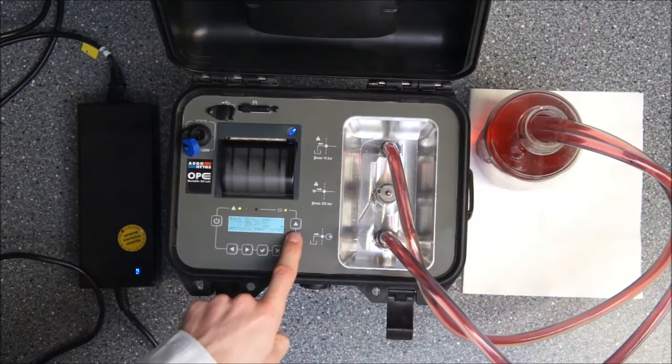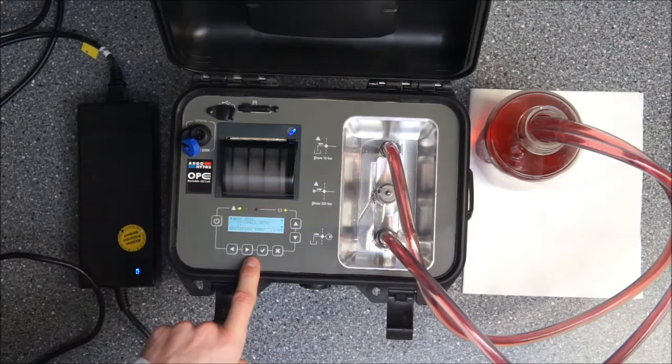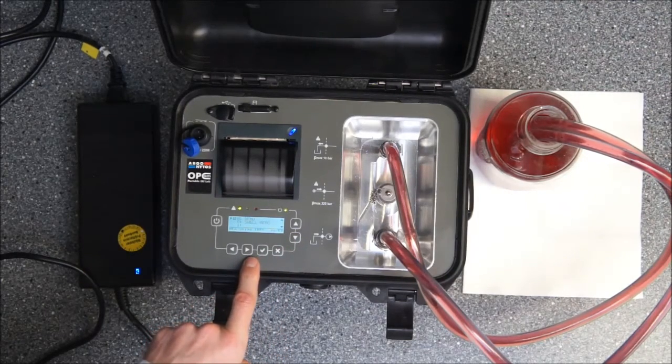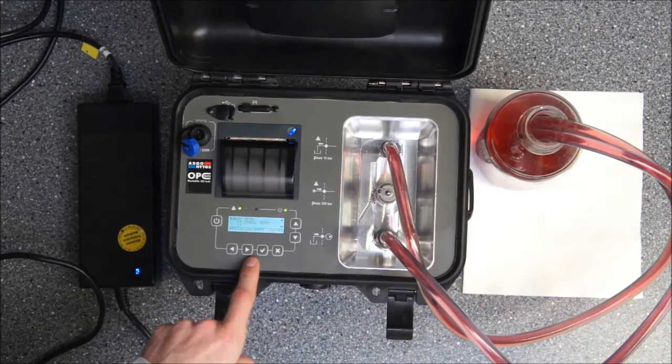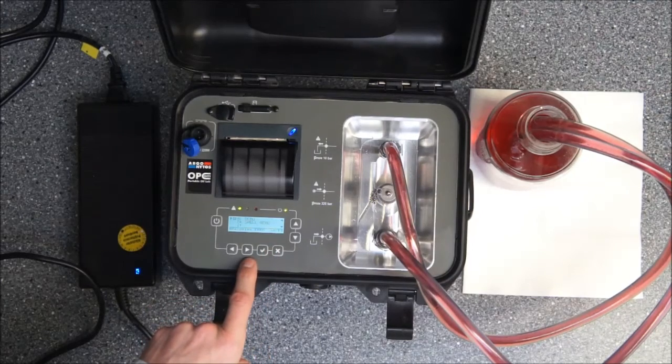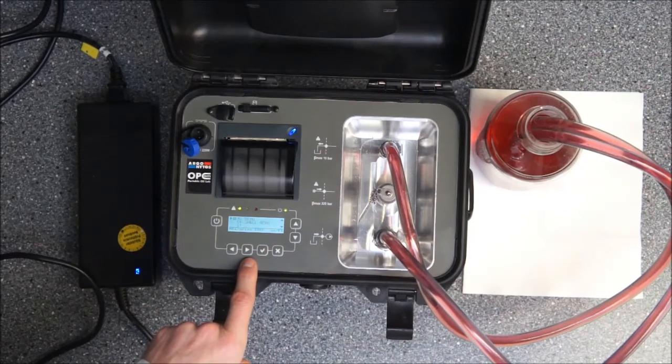So what can we do here? We can put in several measurement information according to the measurement point that we are currently at. In our case I just choose demo mode or demo measurement, and also you see the second point that's the oil we are measuring. It's the Shell Aerofluid.